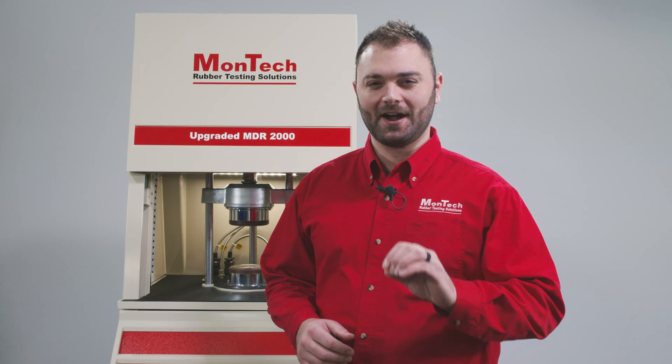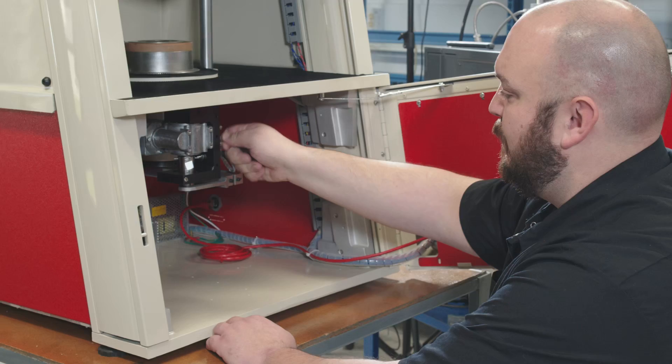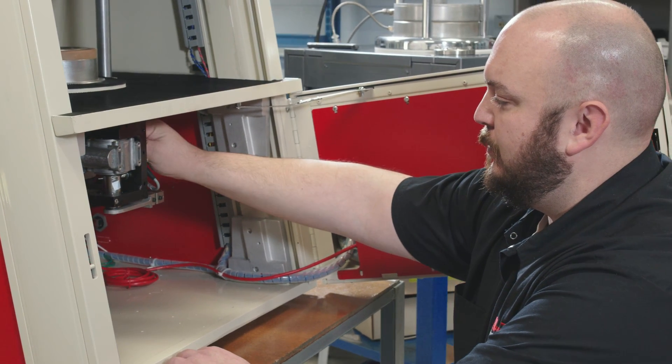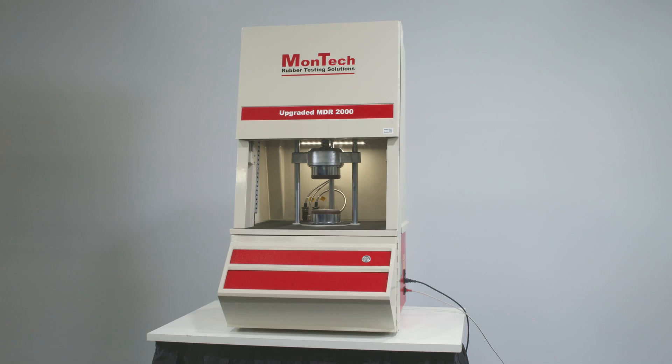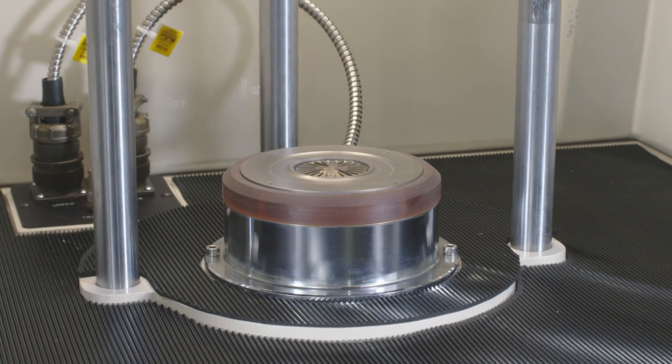Montec's upgrade program is the most comprehensive solution for updating your legacy MDR 2000s. Installed by skilled technicians in our ISO 17025 accredited facility, each Montec upgraded MDR 2000 is completely restored with over 75 new parts and modifications.